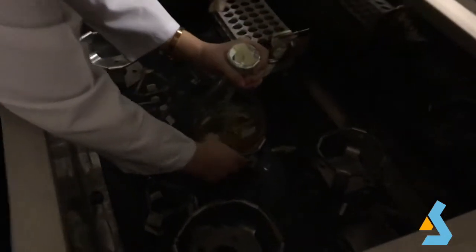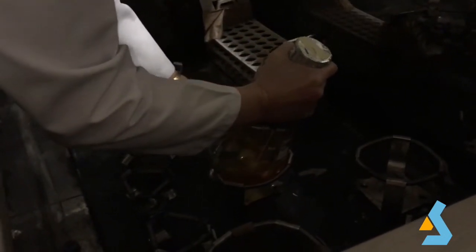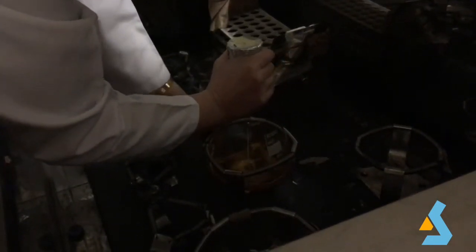Before we go to measure absorbance, we place bacterial growth medium in the shaking incubator at 37 degrees Celsius. Be careful when placing Erlenmeyer in the incubator and make sure it is tightly attached to the chambers inside.